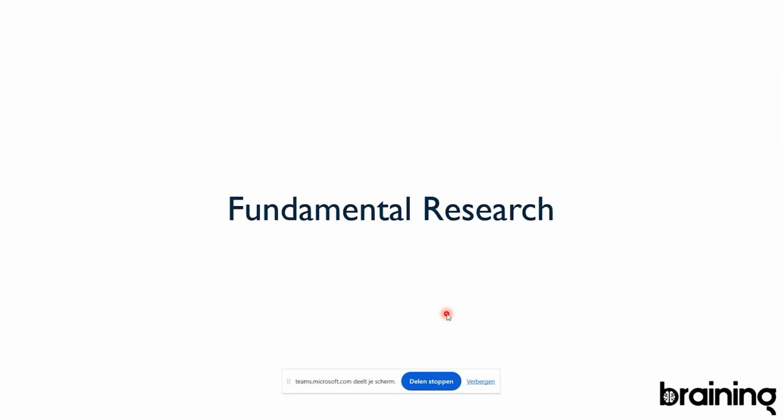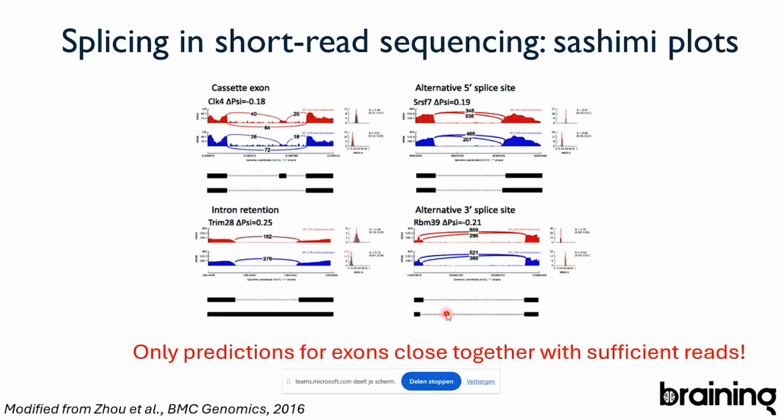I think the word clouds showed that you all think, and I agree, that the brain is an exceedingly complex organ. And so it's important to recognize that a lot of work still has to be done on fundamental processes in the brain before we can arrive at understanding it better. But that being said, an important application of long read sequencing is fundamental research, right? How so? I will give you an example from my own field of interest. So I told you I'm very interested in splicing, and specifically in alternative splicing.